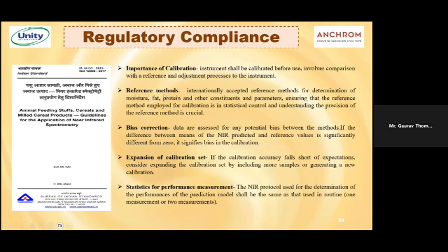The data that you feed in from the reference method or the primary method, how it shall be collected and how it should be put in the software. It talks about that. It also talks about bias correction. Now again, NIR being a secondary technique, it also allows bias correction, wherein if the difference between your actual reading and the desired reading persists, you could add a bias there. The offset could be added with a plus or minus, and then the adjustments would be made automatically by the instrument, and the readings would be given to you.